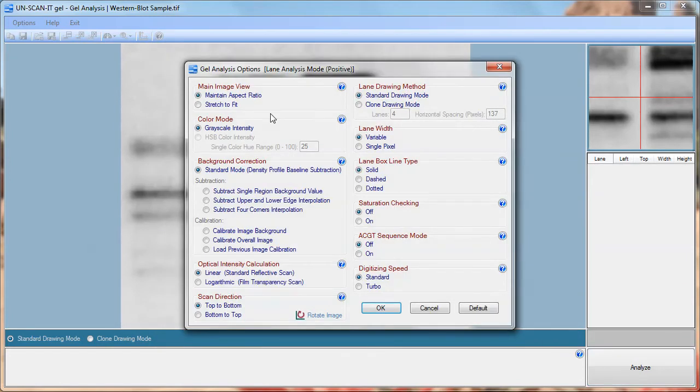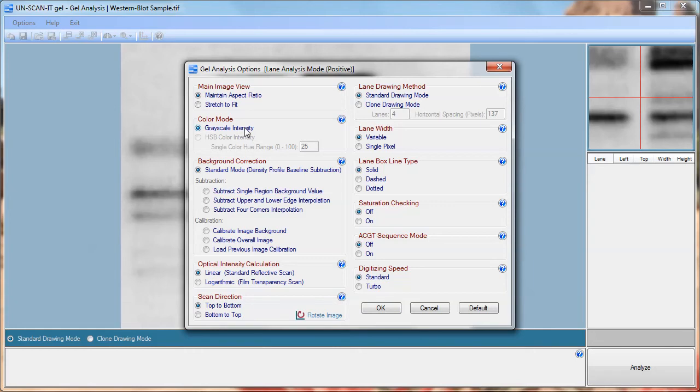Multiple gel analysis options will be presented and you can choose the options that best fit your gel analysis needs. For most gel images the color mode selected should be grayscale intensity. For this tutorial we will simply accept the default options. These options are explained further by clicking the question mark button associated with each option.